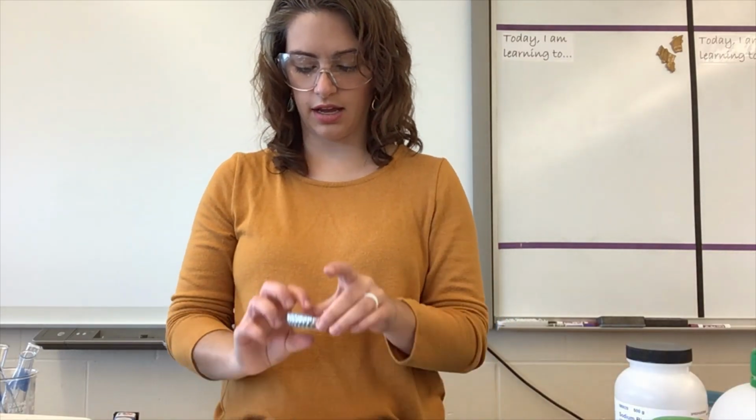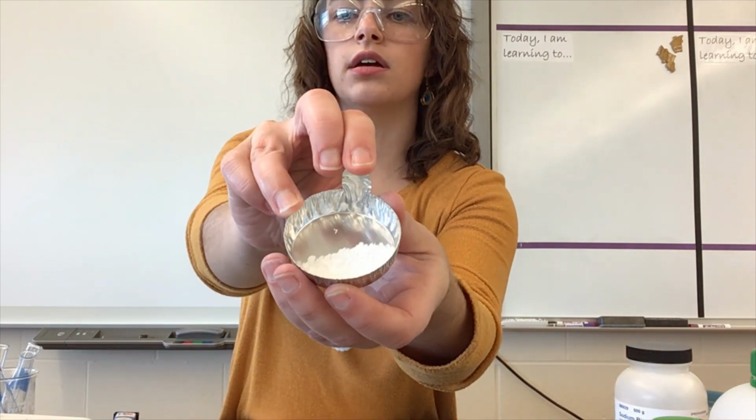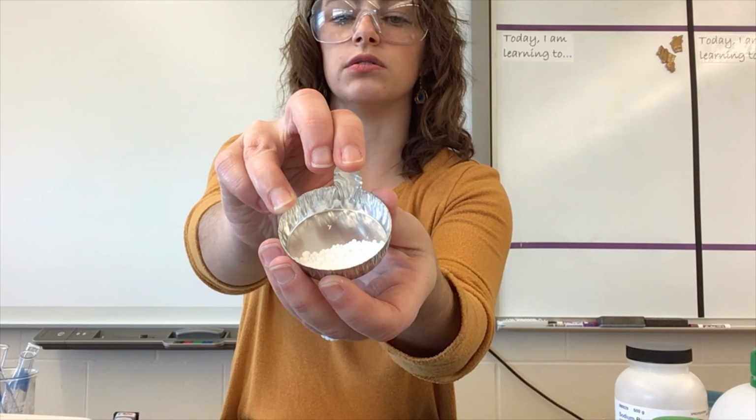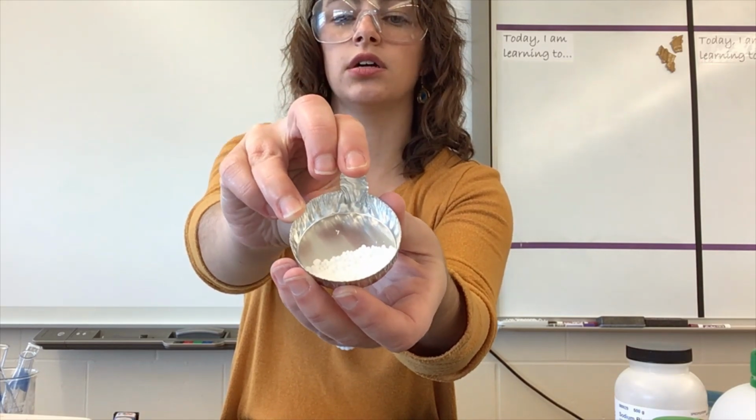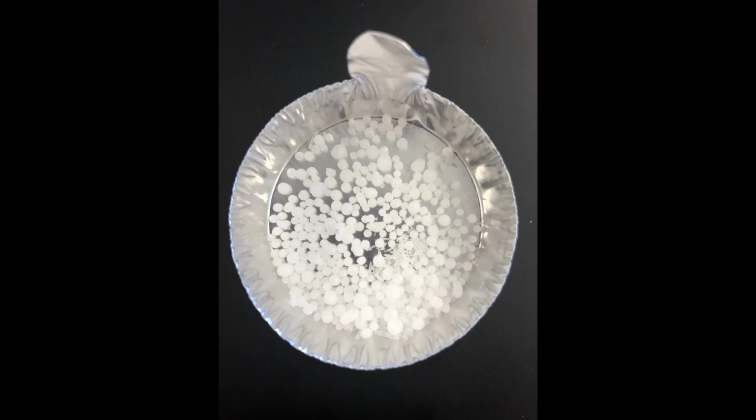Set that off to the side, and I'll hold this up so you can take a look at it. And then I'm going to take a picture so that you can see a nice still close-up of what this looks like.